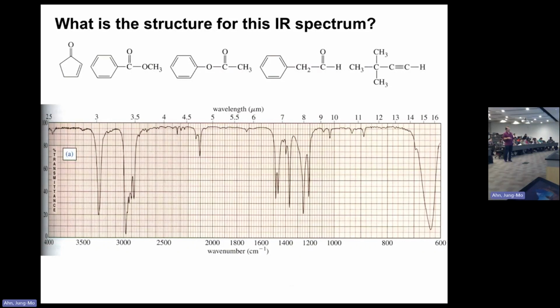We've got an IR spectrum here, and you want to find out which of these structures shown up here this spectrum belongs to. So we're trying to recognize signals that we can use to solve it. What is very distinctive in the structure here? I would first point out that this sharp band at about 3300 is very easily recognizable, right?